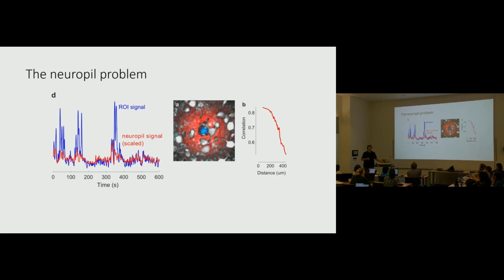You will also get something like that in different brain areas. Under anesthesia, you get a lot of synchrony. In slices, you get a lot of synchrony. And so there, in fact, what you'd expect is that these functional methods will start merging together nearby ROIs. I think that's a good discussion to have later of whether you should still be using a functional algorithm for that, or you should be thinking maybe of switching to a structural one.